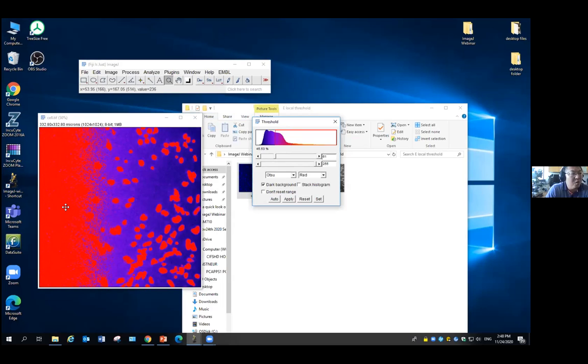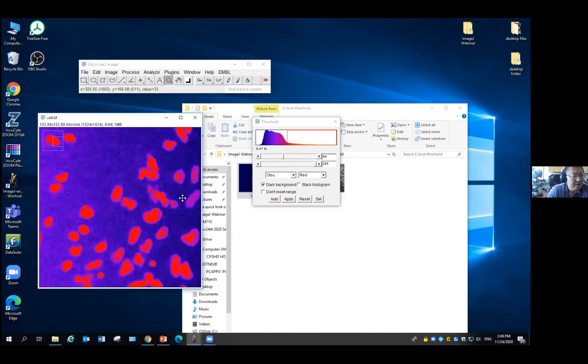They're all over the thresholding value because the background is high. If I change it higher, so the left side becomes a nice representation of the cells, then the right side is wrong. Some of the cells, they don't even identify.